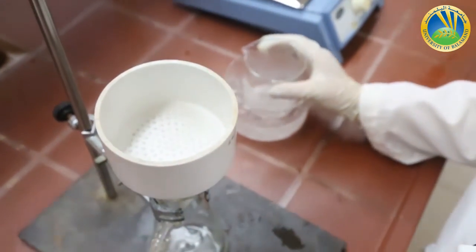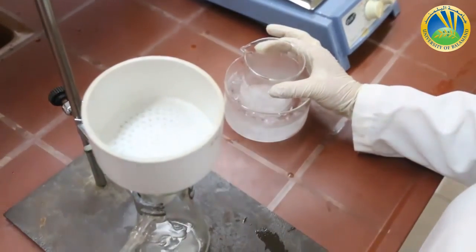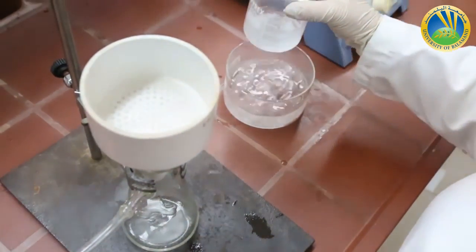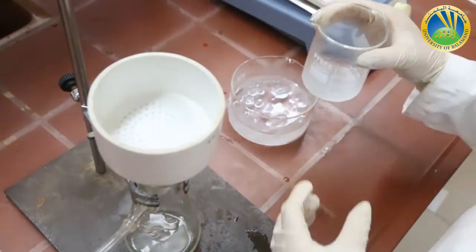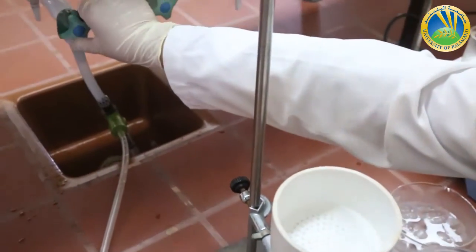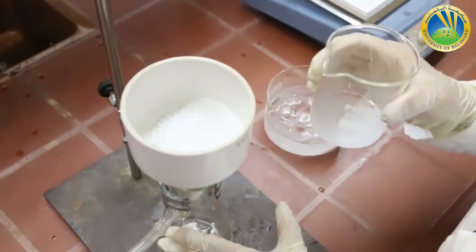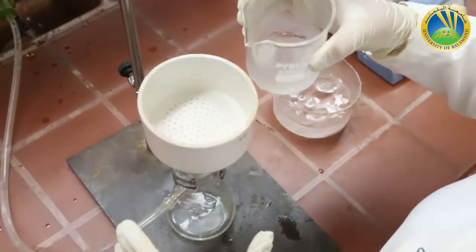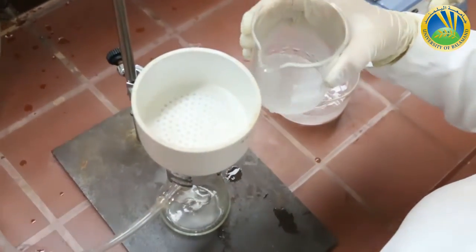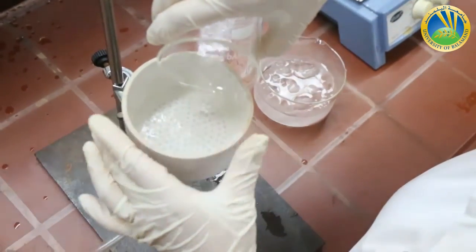I can leave my crystals to cool down at room temperature, or I can use some ice to cool it. Now I have to do the filtration. I open the water on to have vacuum inside my Erlenmeyer, and I have to get all the crystals on the filter paper.